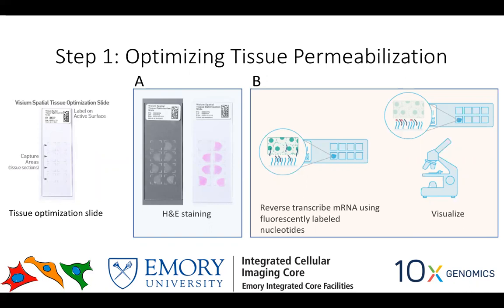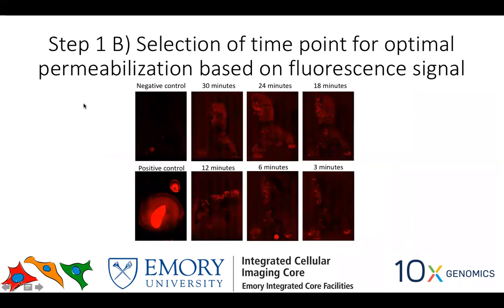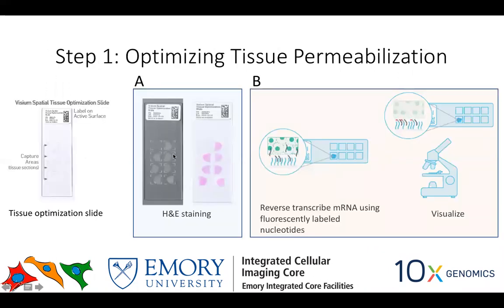Okay. So the top right is, I thought that was the negative control. No. So exactly, the top right is the negative control. That's what you are looking over here, right? So top right, if you flip it, I haven't flipped the image, but if you rotate this 90 degrees towards the right, this becomes your negative control. This becomes your positive.